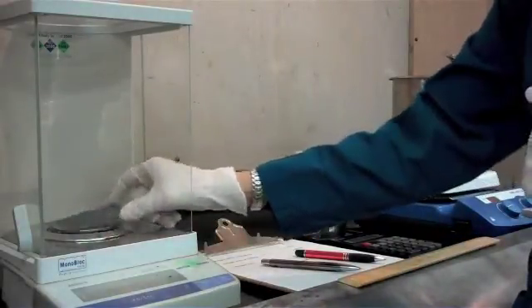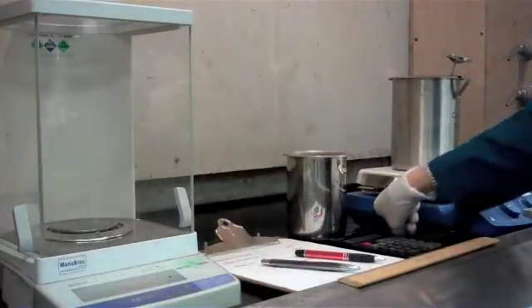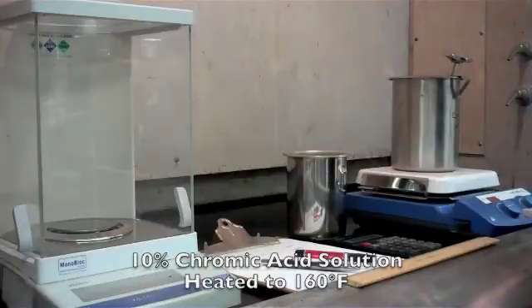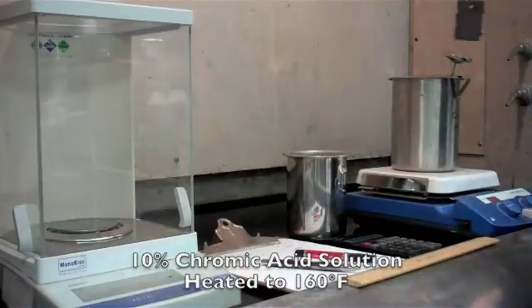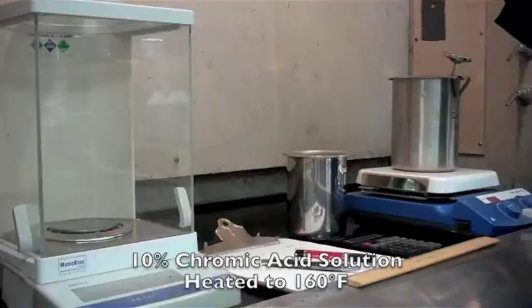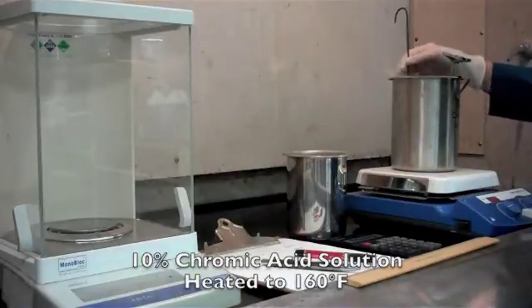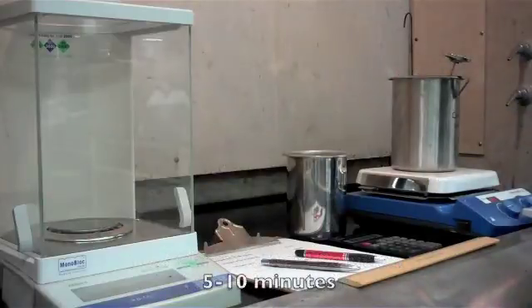So now that we know our weight and our surface area, we're going to take this panel, put it on a hook, and submerge it in a 10% chromic acid solution that's been heated to 160 degrees Fahrenheit. We're going to put that in there, make sure it's completely submerged in the chromic solution, and we're going to set our timer for 5 minutes.